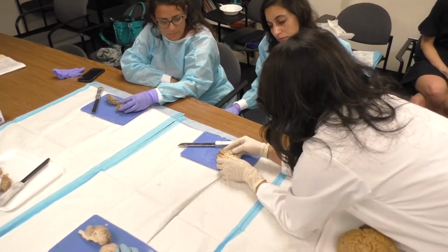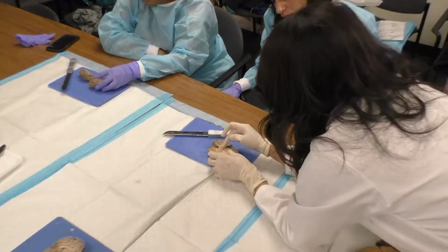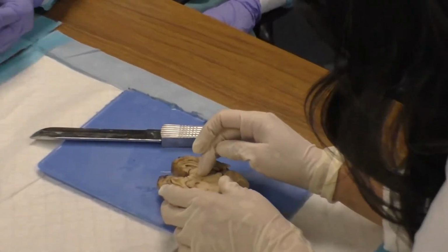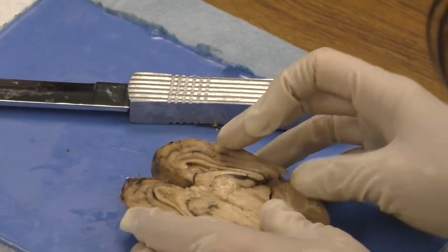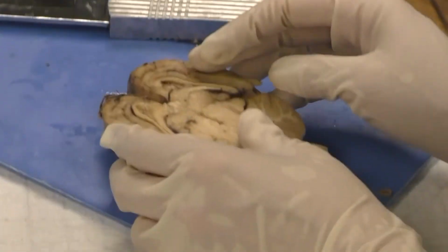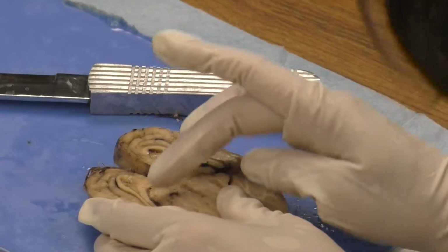Can everybody see a circular kind of structure? Right here, that little ball? Yes, okay, that ball. There's several balls. Try and identify the correct ball. That is the ball of the thalamus.